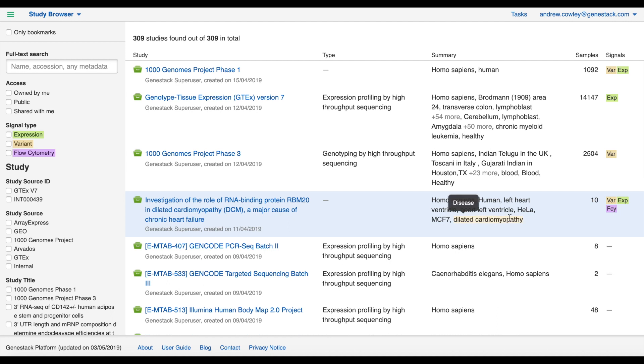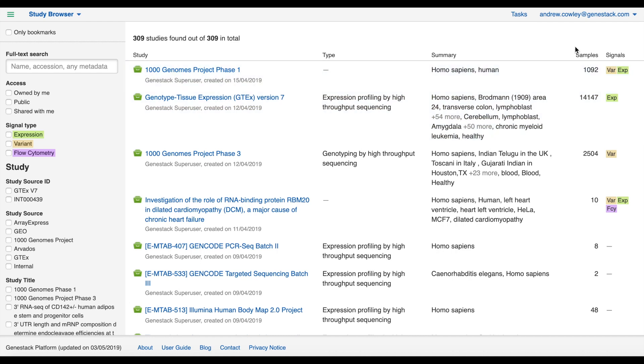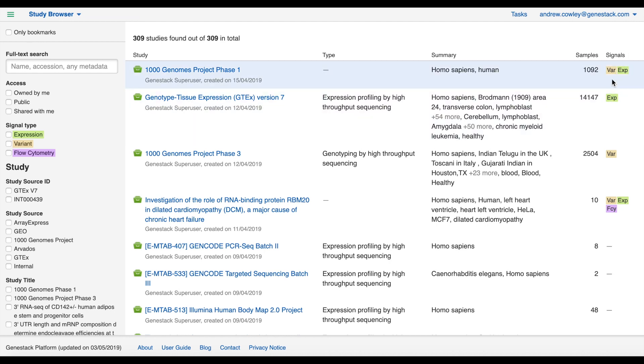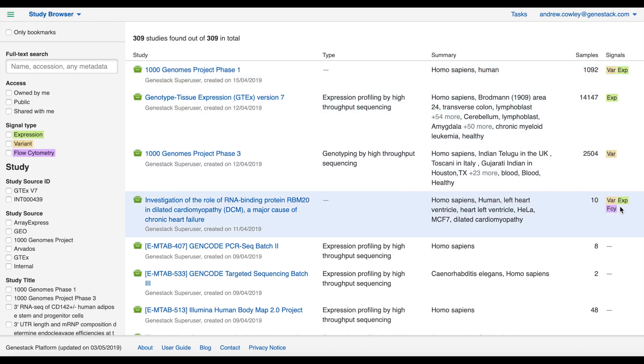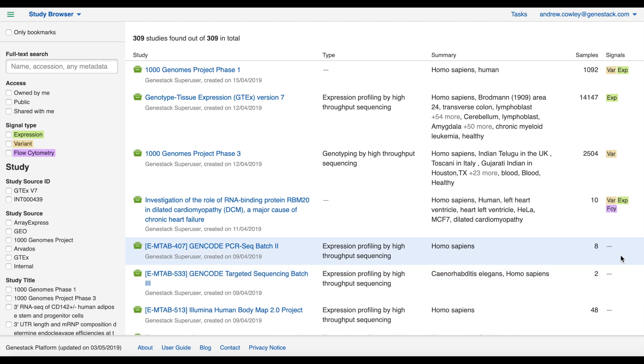The next column tells us how many samples are present in each study, and the final column shows us what types of experimental signal data are present for each study. Here we've got expression, variant, and flow cytometry signal types. Some studies have all three, some only have one or two, or none.